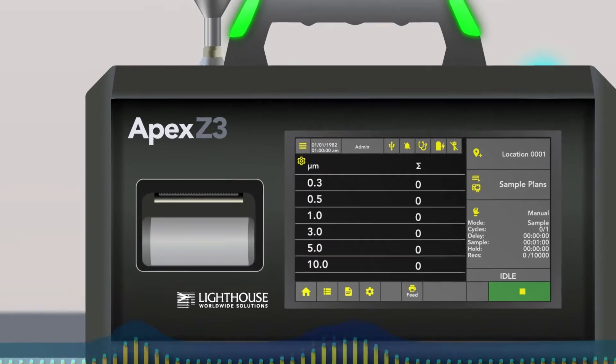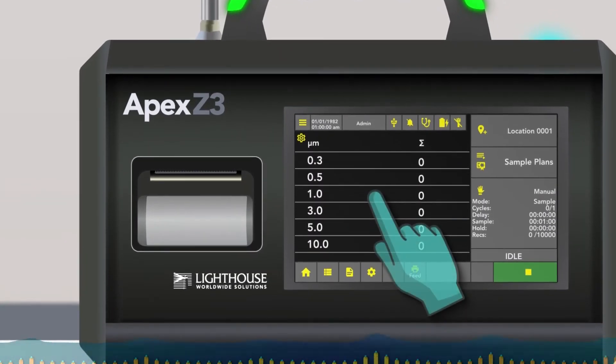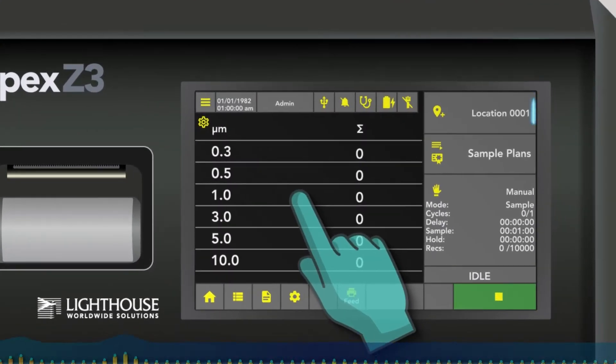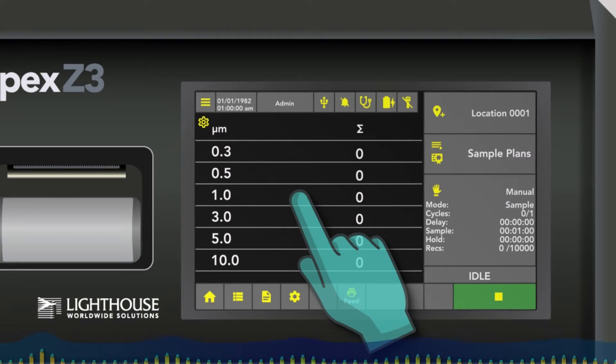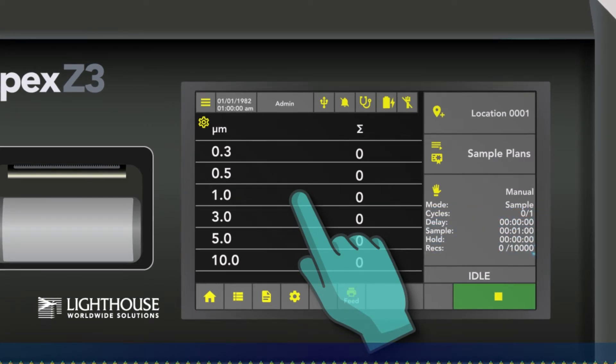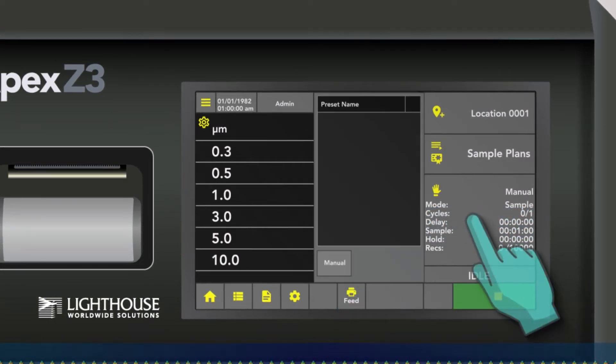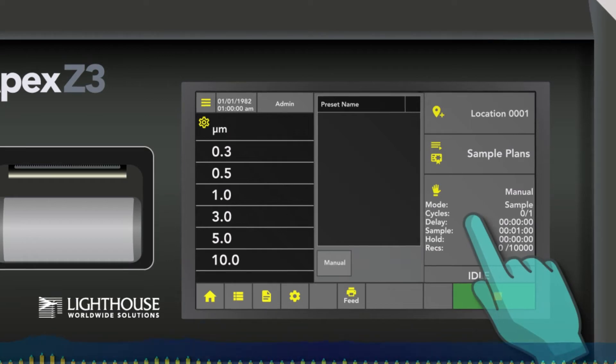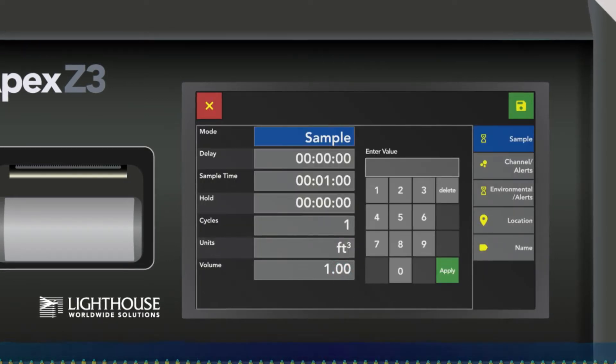If you look here on the Apex Z, over on the right are all of your action buttons, your sampling buttons. In the bottom right are all your sample settings. You simply touch that and hit a button down here called Manual, and that's your manual sample settings.